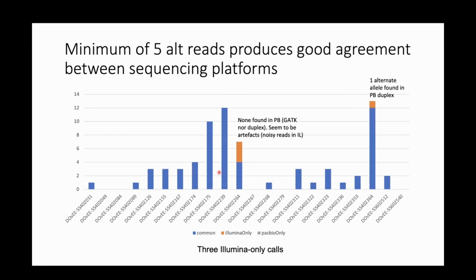So both give us more or less the same calls, with the only difference that the Illumina sequencing gave us a few more calls. So then we asked ourselves, what are these calls, and what is their extra really, in the regions in which the calls have been made?